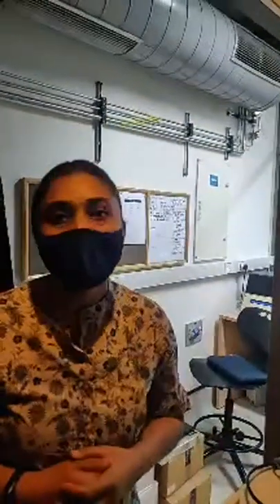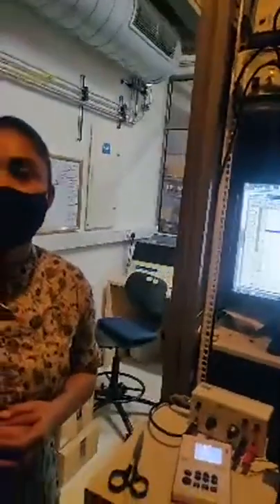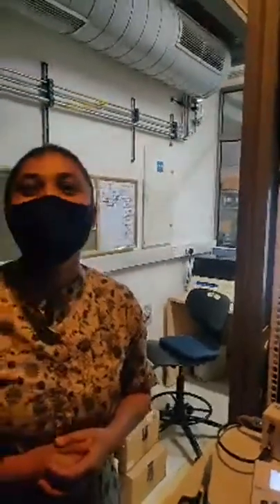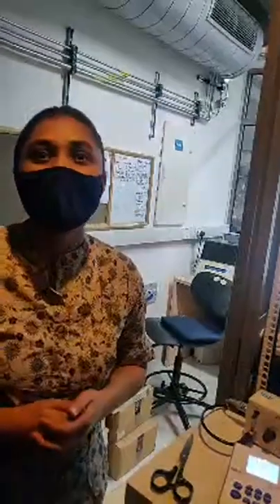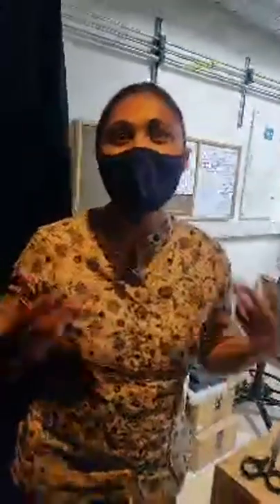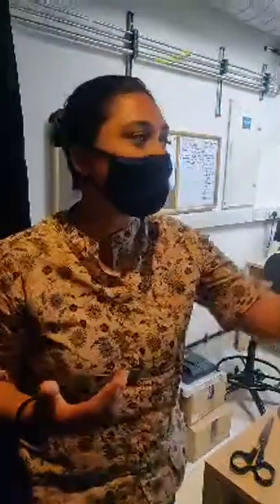So you have to use very specific stimulations because this is a millimeter long fish, right? You won't be able to show it pictures of people or things happening like you would to humans. With this tiny fish, you have to have these abstract things, so whatever makes meaning to the fish. Mainly they swim, so you want to give them input in response to which they feel like they have to swim. So something that generates movement in them, right? Exactly. That's nice.